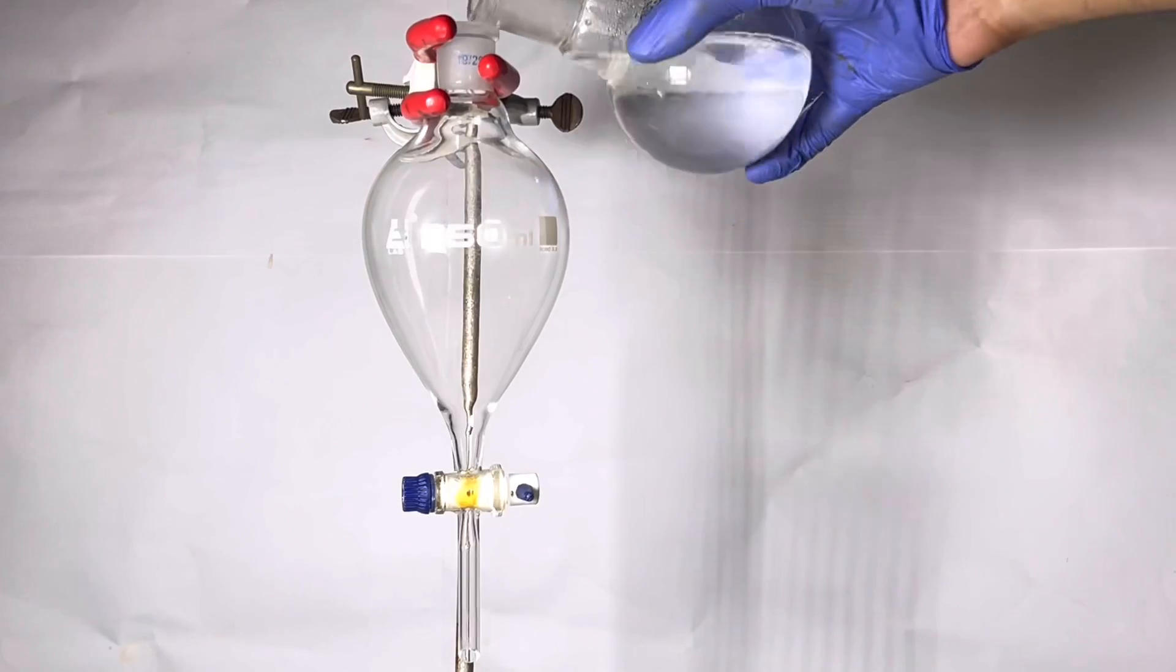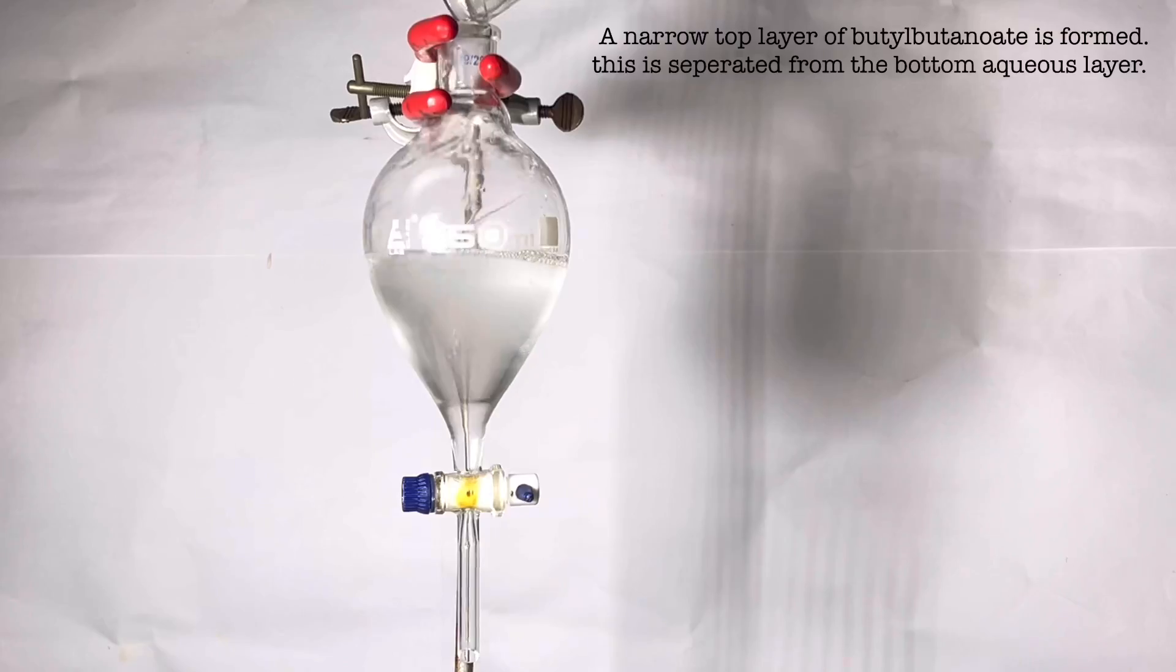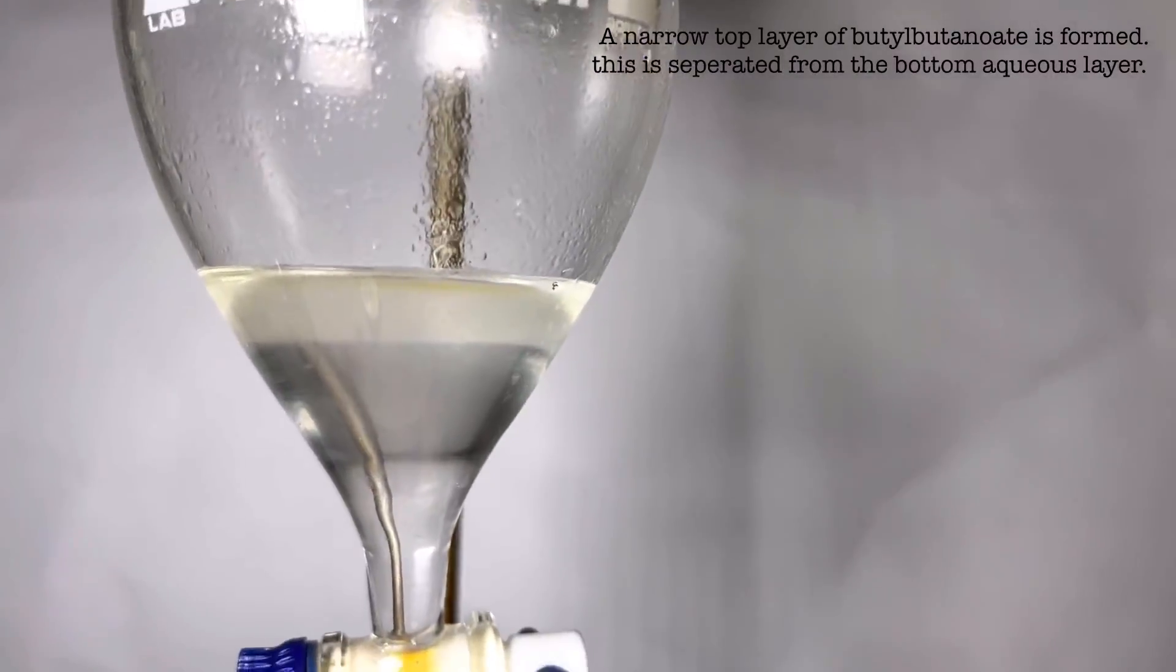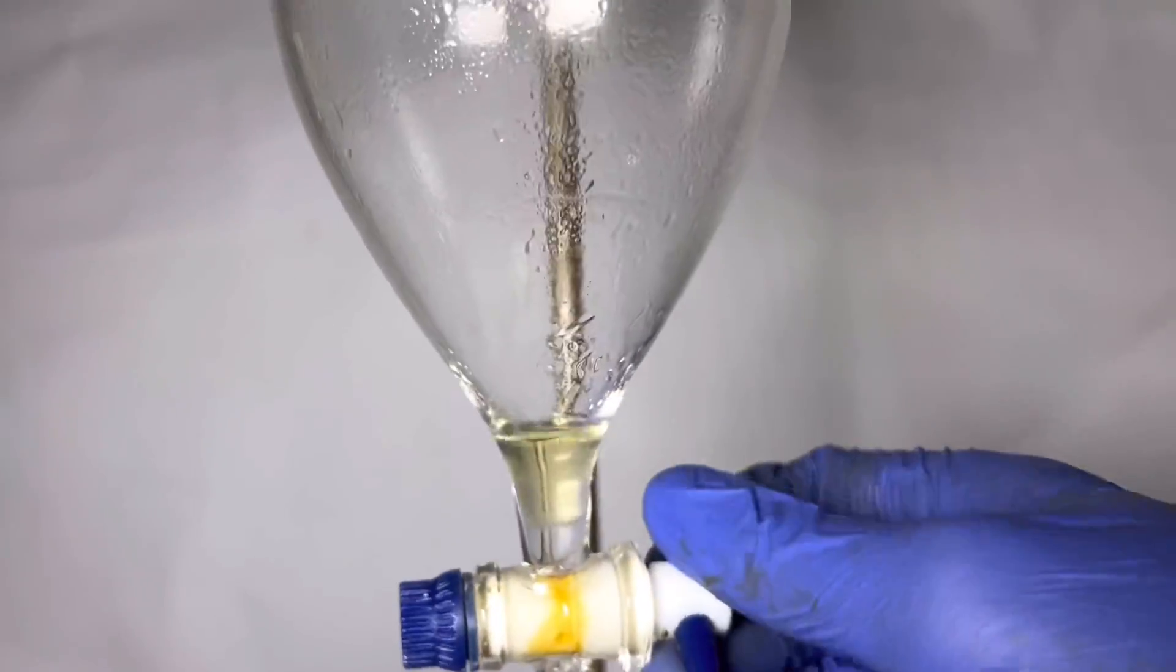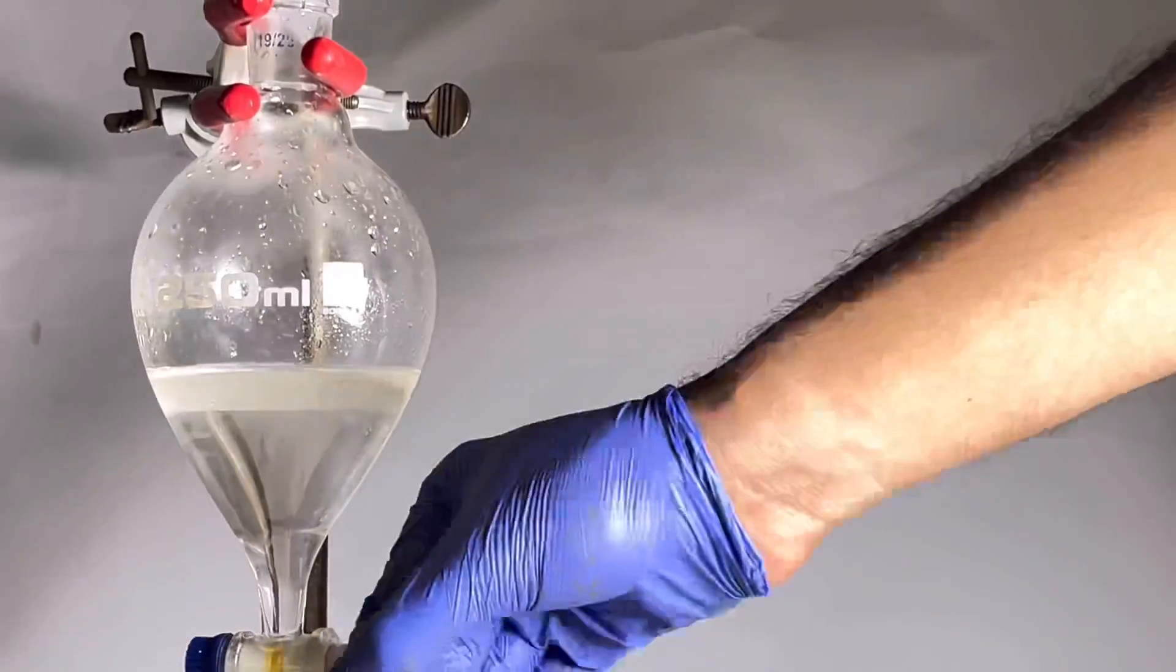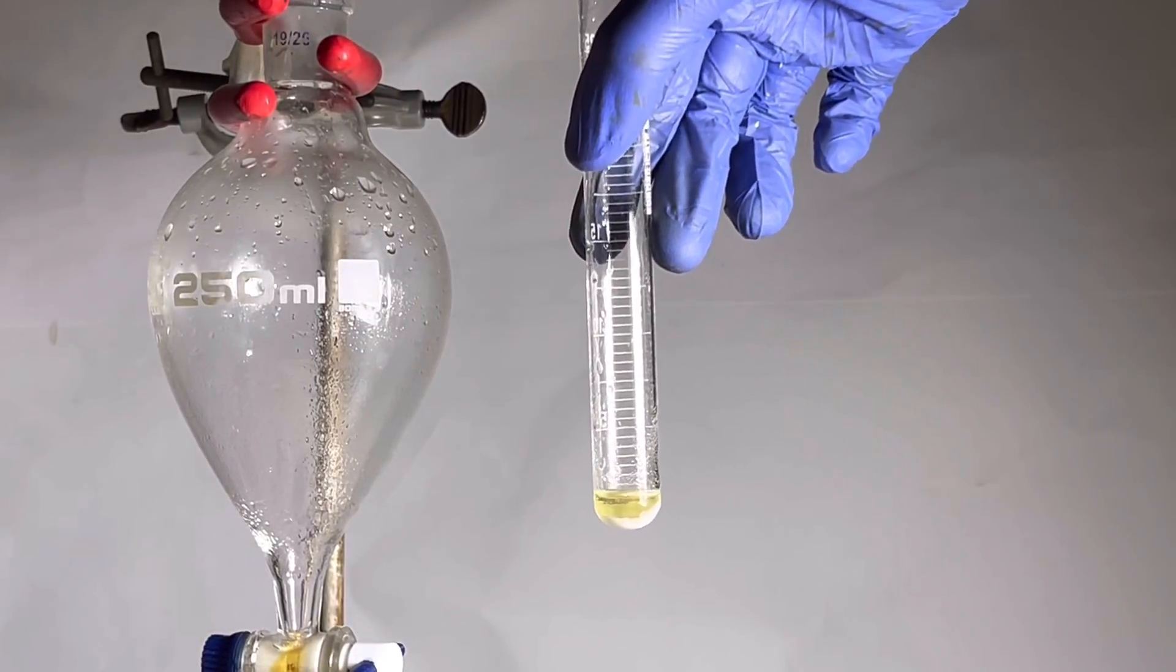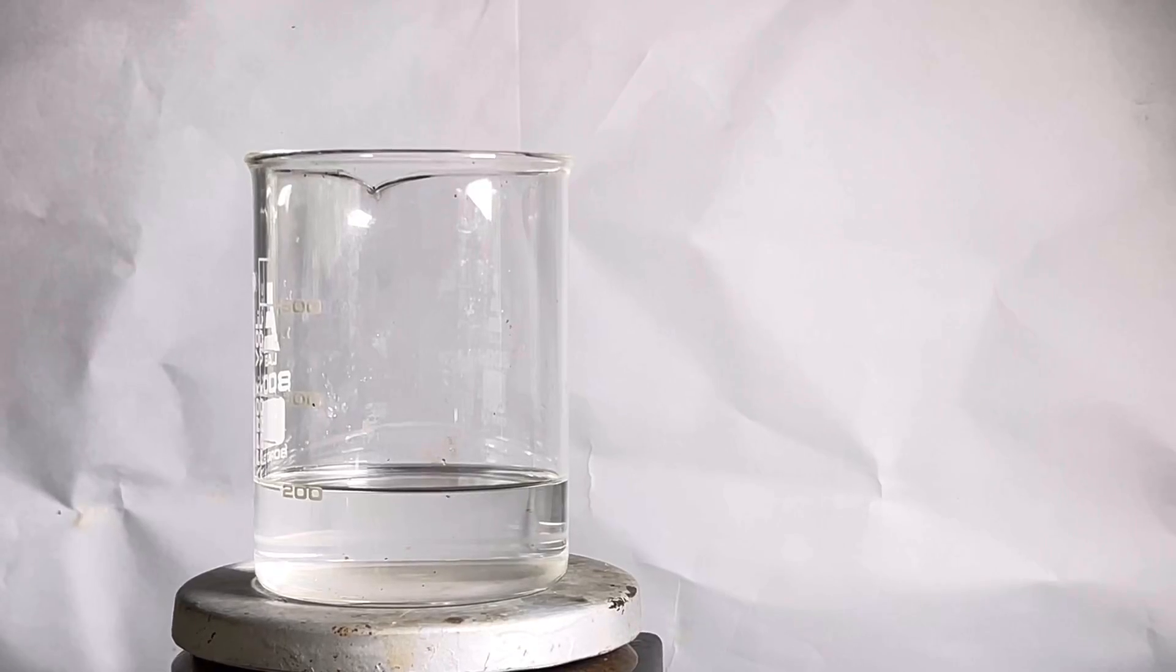Now the contents of the receiving flask was transferred to a separatory funnel. On the top we see a small separate layer and that is the butyl butanoate ester. The bottom aqueous layer contains the butyric acid. The aqueous layer was collected in a beaker and the top butyl butanoate layer was washed again with distilled water and the water layer was discarded. The butyl butanoate was collected in a small test tube with some anhydrous sodium sulfate to dry it. Butyl butanoate has a very pleasant smell similar to pineapples. It was then stored in a small dram vial.